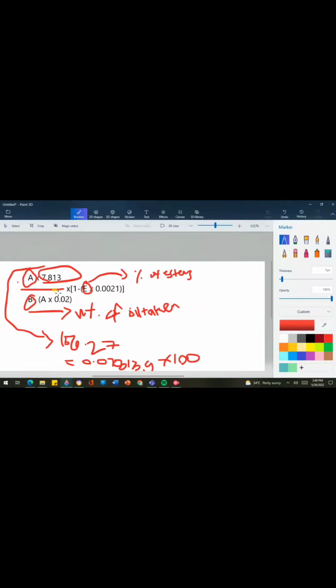So, yung sa 0.021, basta 0.021 dapat yan, which corrects for the weight of acetyl radical in the sample of acetylized oil. The factor 0.021 being the amount of acetyl radical equivalent to 1 ml of 0.5N potassium hydroxide.